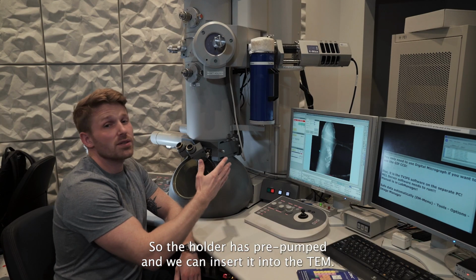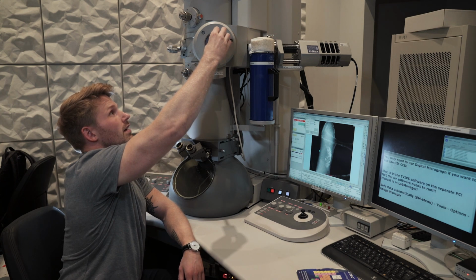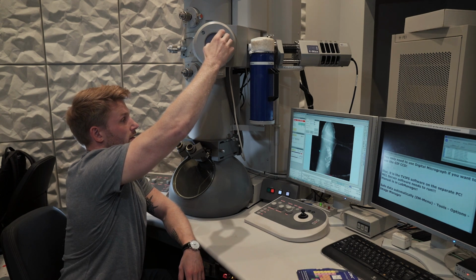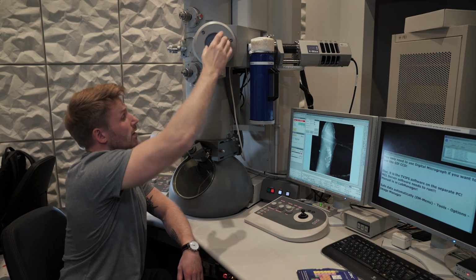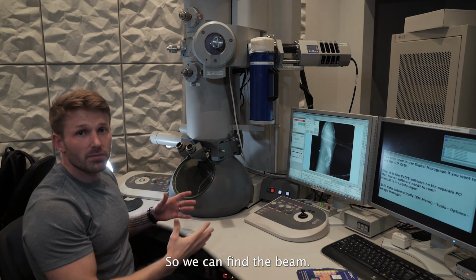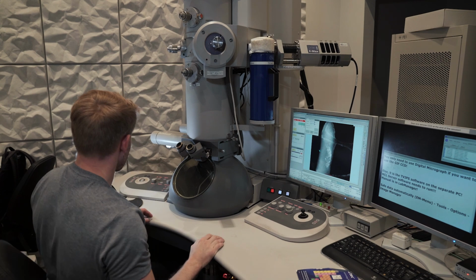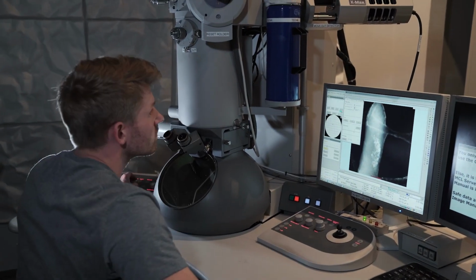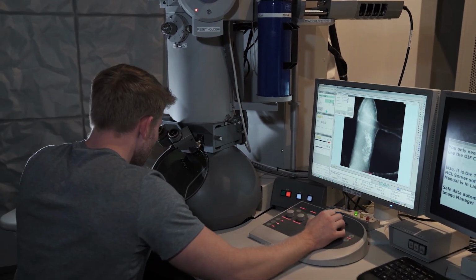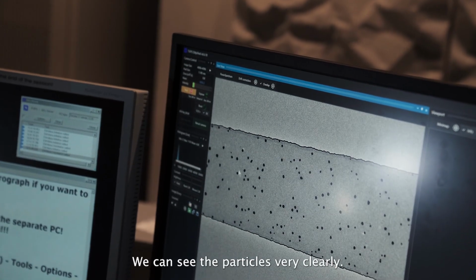All right, so the holder has pre-pumped, and we can insert it into the TEM. And the vacuum is good, so we can find the beam, find the channels, and see if we have some crystals growing in there. We can see the particles very clearly.